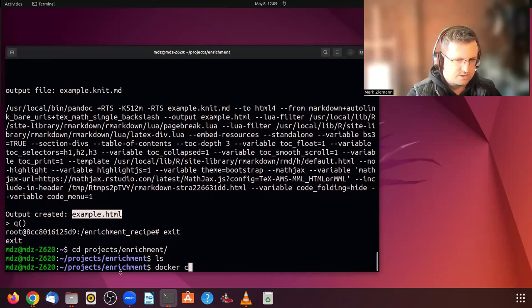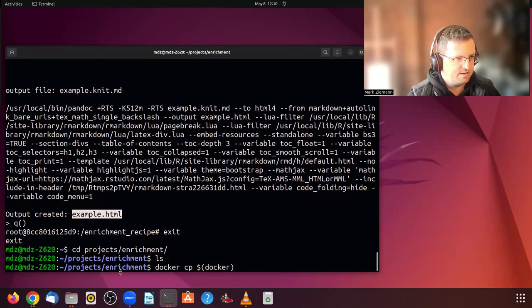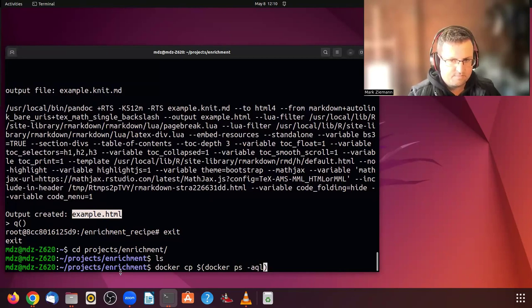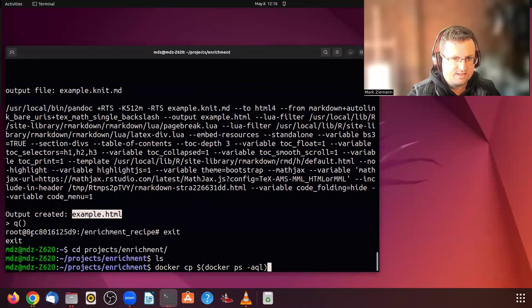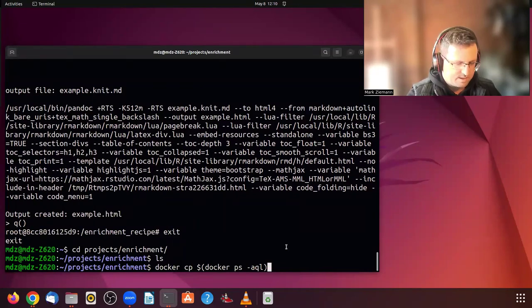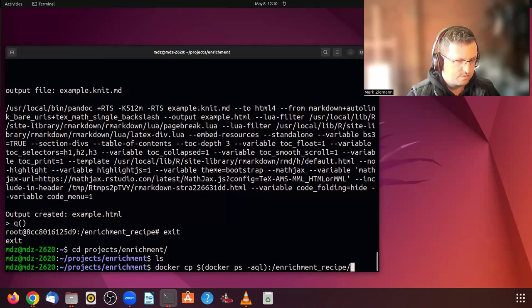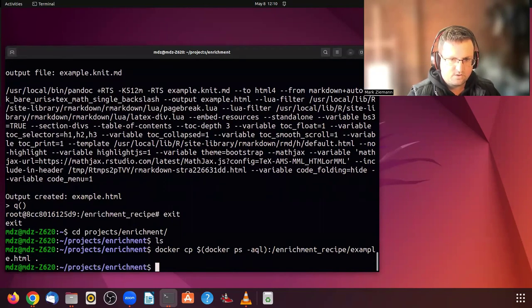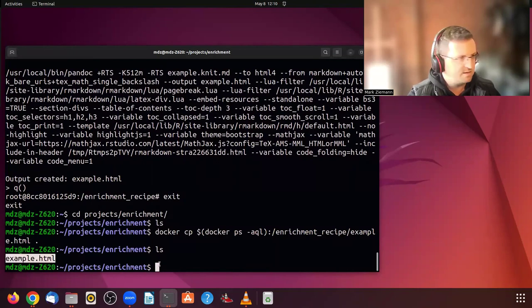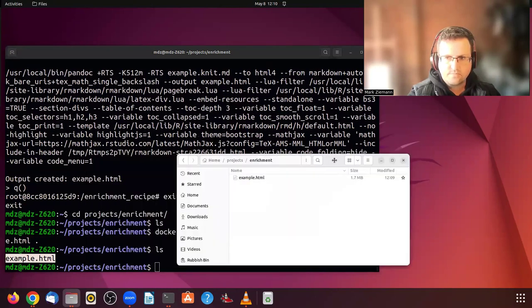So to do this, we use the Docker CP command. And in a nested command, we have to find the last container with Docker PS. And these options just give us the identifier of that container. I think that'll be this code here. Nevertheless, we will get that HTML file and copy it. And now when we have a look at the contents of this folder, we can see that example.html is there.